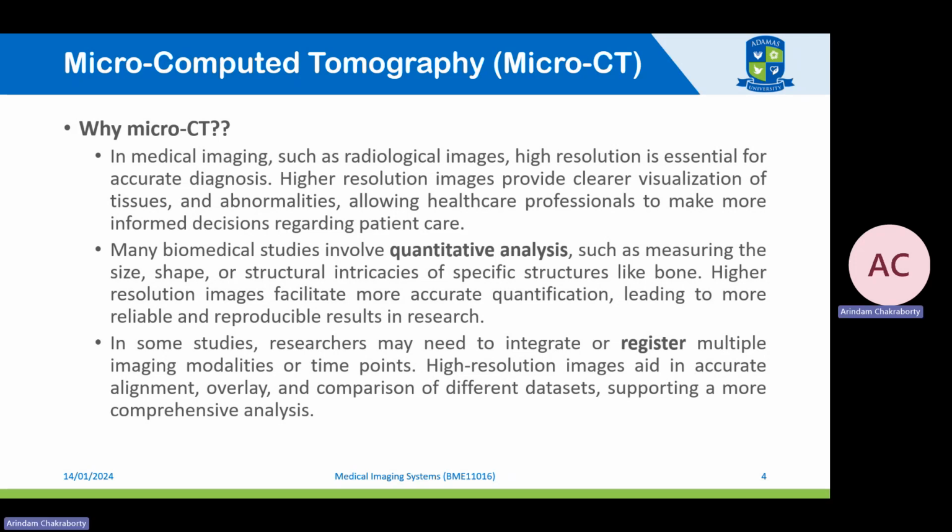Like I said, bone can be measured. That can be done using quantitative analysis. There are software algorithms developed solely based on micro-CT based imaging that can provide quantitative data regarding the structural details of the different aspects of bones. So higher resolution here can provide more accurate quantification, leading to more reliable as well as reproducible research results.